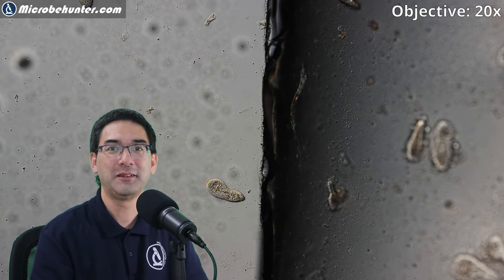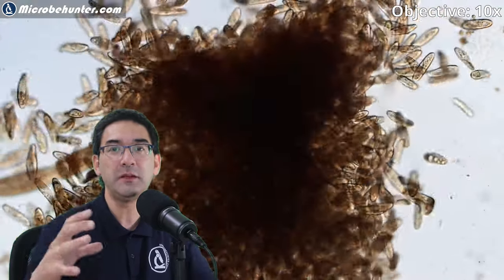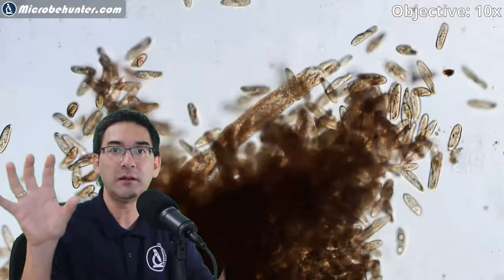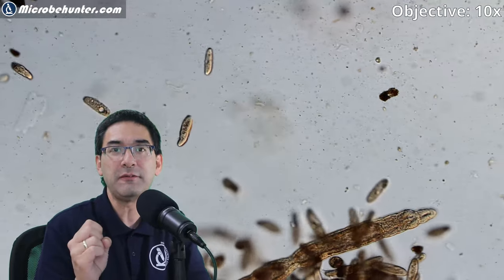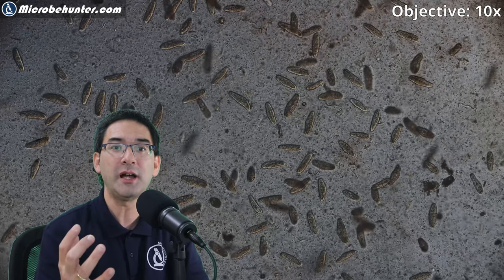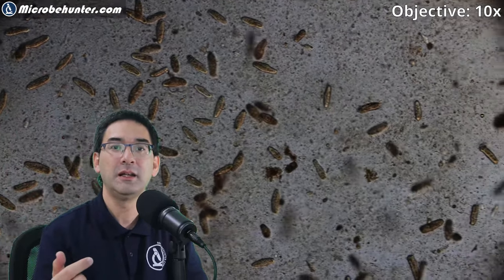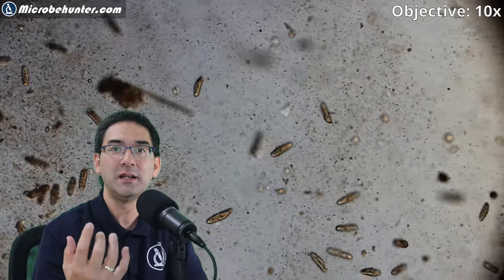Here you can see them moving from one area into the other and immediately going out of control — one of them died before even reaching the highly concentrated area. I noticed that many of them were clustered together, because everywhere else there was chili liquid, so they moved away from it and clustered in the still-safe area. The further away from the safe area, the more they start spinning and going out of control where the concentration is much higher.